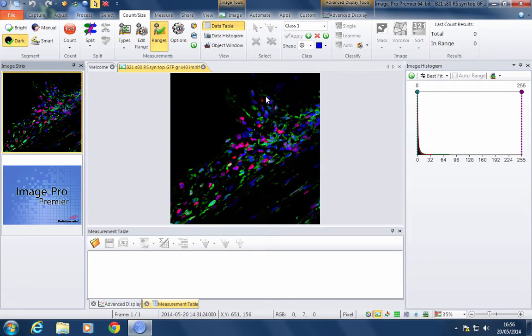In this short video I will show you how we can classify objects according to intensities of various colors. In this case we have nuclei in blue, and we're interested in finding out how many of those cells have red staining and how many have green staining. The simplest way to do this is to simply count the blue nuclei and measure their red or green intensities.